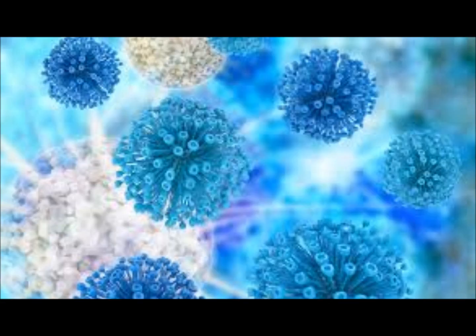What do you think on 39 are key things that you have to have? And what did you learn when you're the tech plating plates? Where do you label everything? On the back side, right? Media side. And it makes sense the lids could get displaced, and we wouldn't know who's what. So your date, usually they'll have some label with an ID number, and the name of the patient will be on the ID number and the date it was set up.